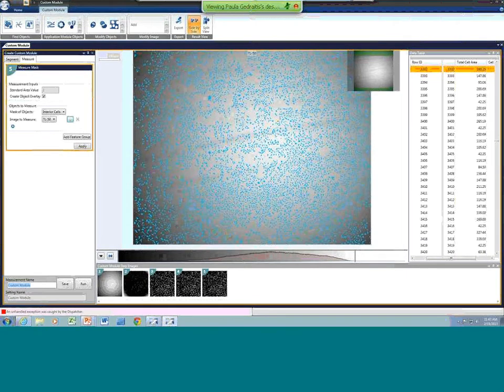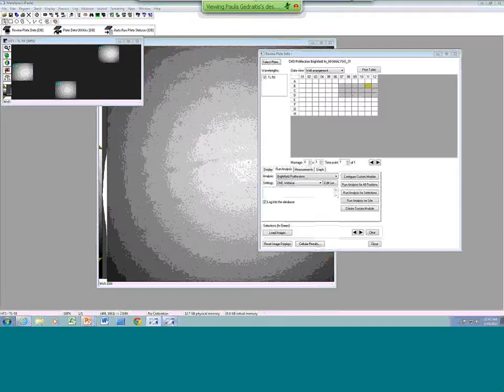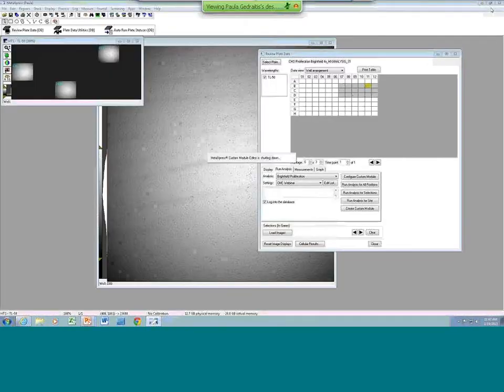So I can go ahead and name this module. Okay. All right. And now I can run this analysis for the plate.